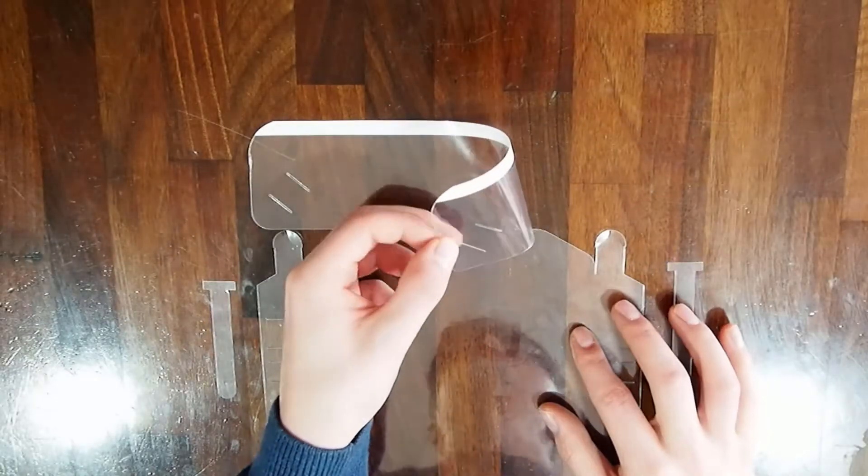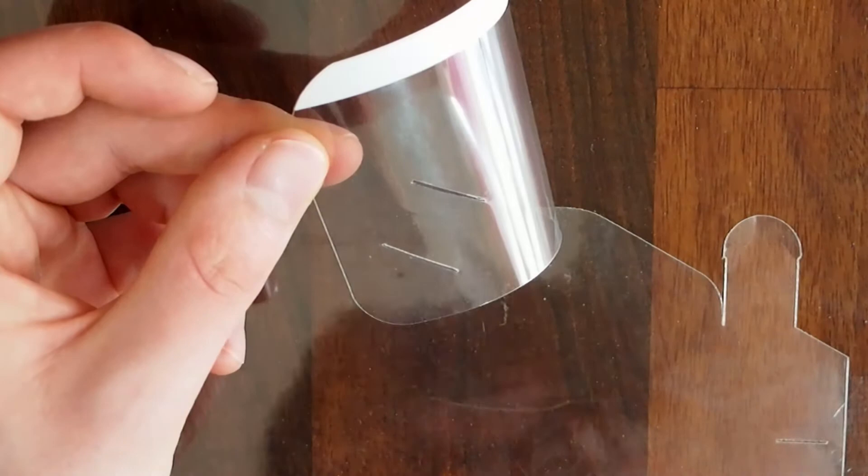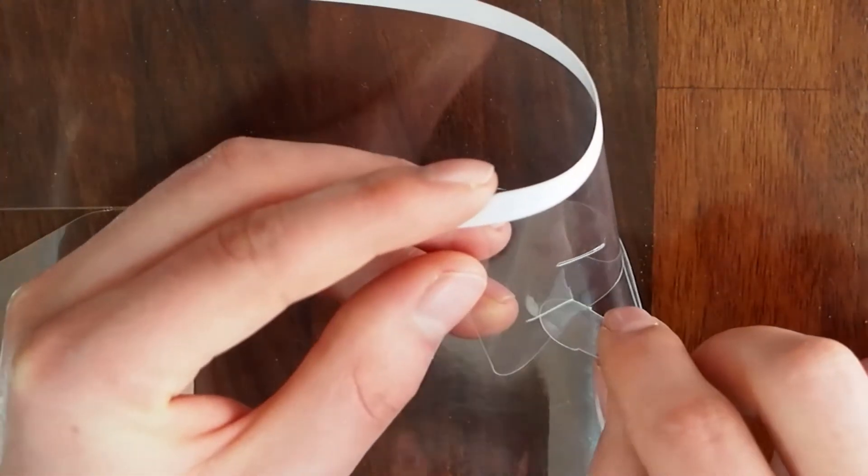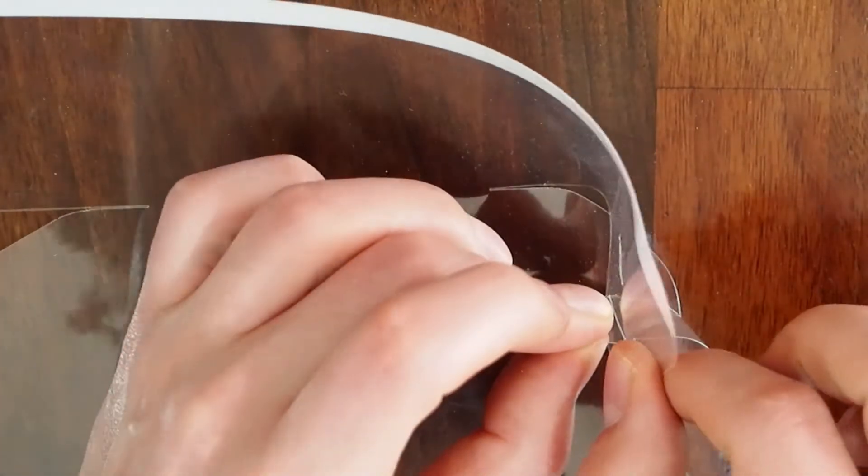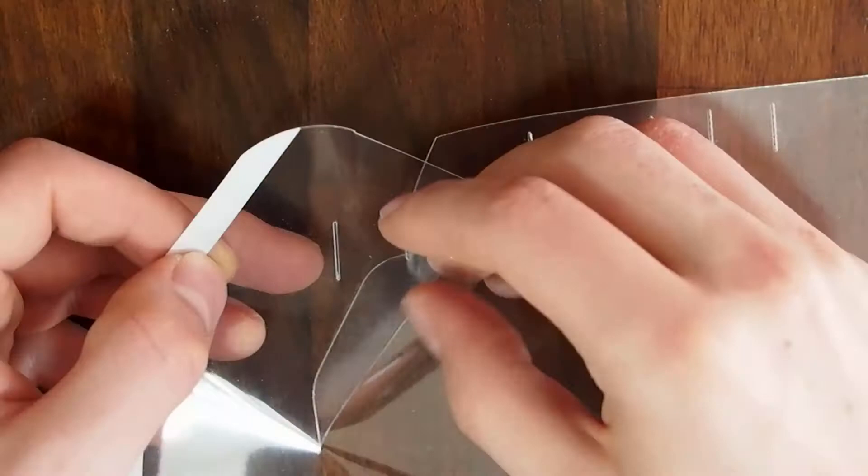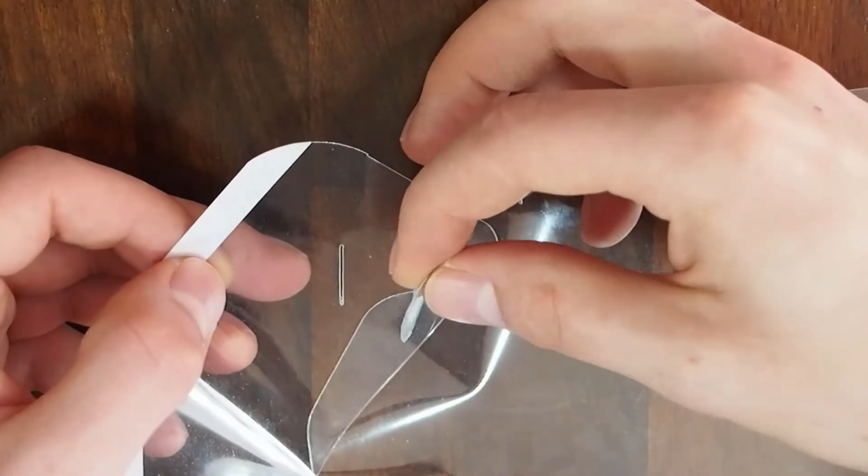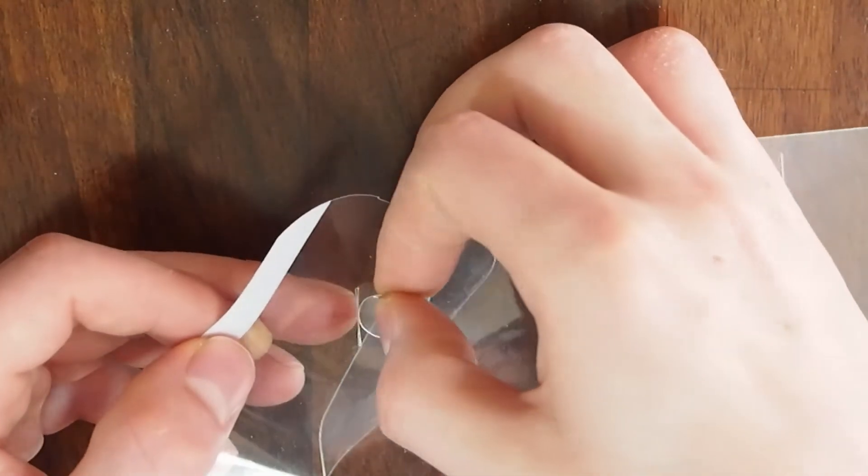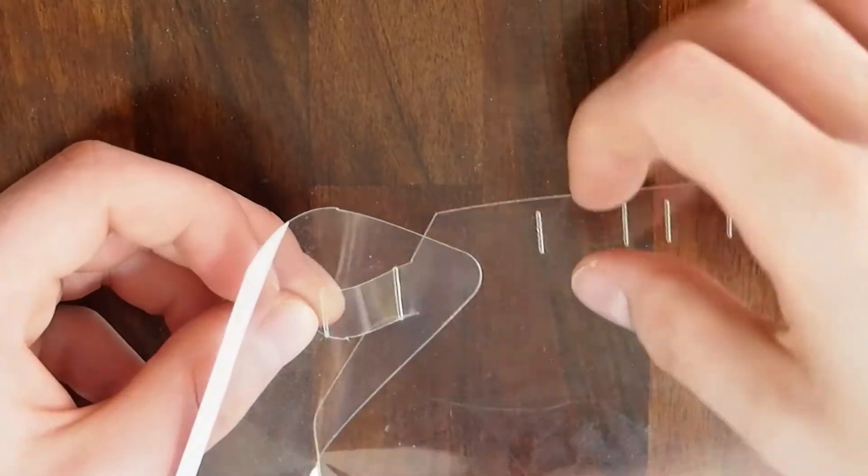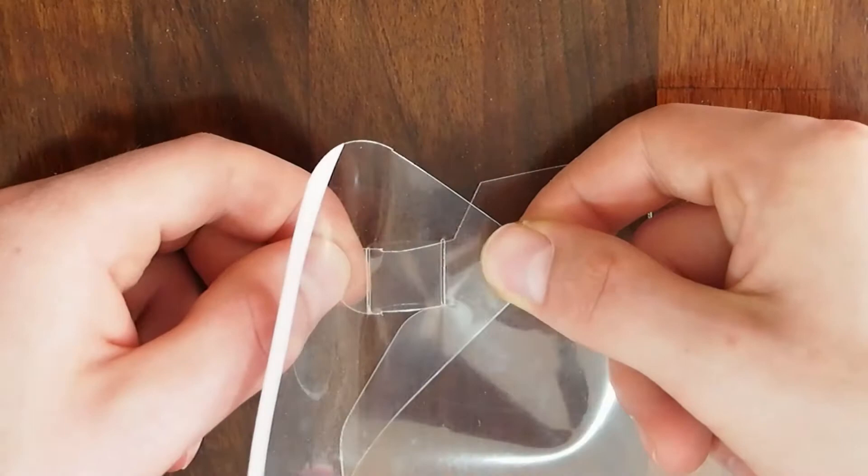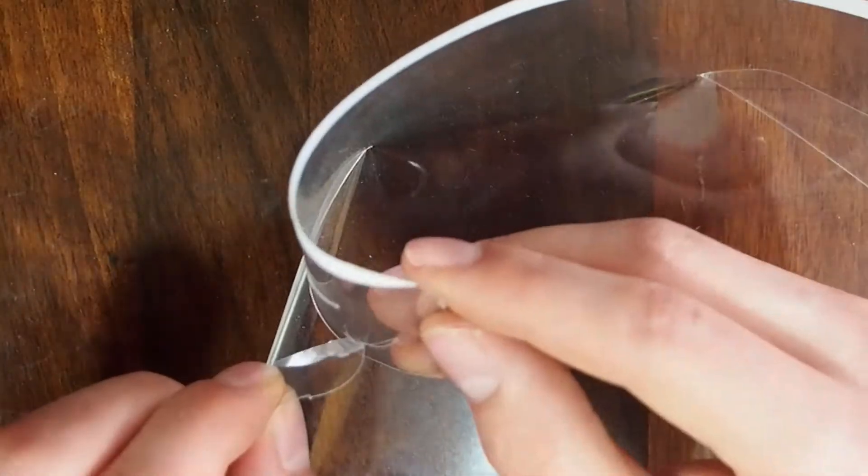Then, fold over the upper flap and feed the tongue through the lower slot from the outside in. Pull that through and feed it back through the top slot to the outside, making sure to pull it tight so it locks into place. Then repeat for the other side.